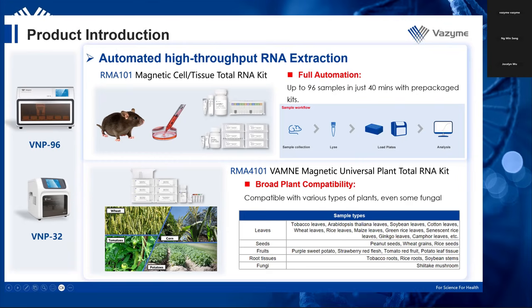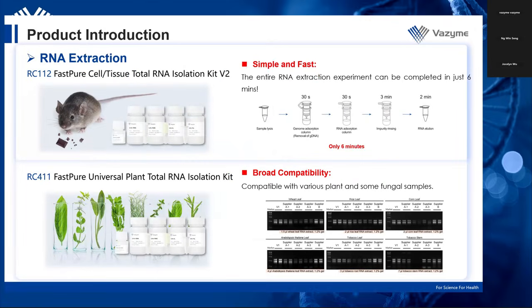These are all automated, and it comes in these cartridges. These are for the pre-treatment. Once you have done the pre-lysis, the pre-treatment, you load it onto the cartridge and load the cartridge into the machine, and it will run smoothly. And you just need to extract the DNA at the end, or the RNA in this case.